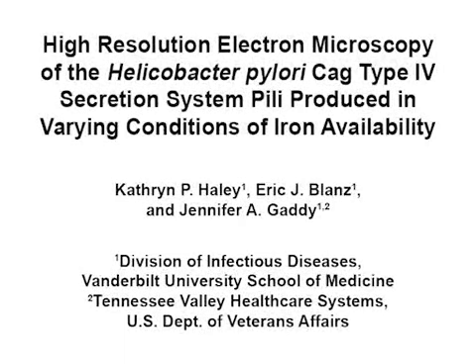The procedure visualizes the hyperproduction of CAG type 4 secretion system pili, which occurs under conditions of iron limitation. First, culture H. pylori under conditions of iron limitation.